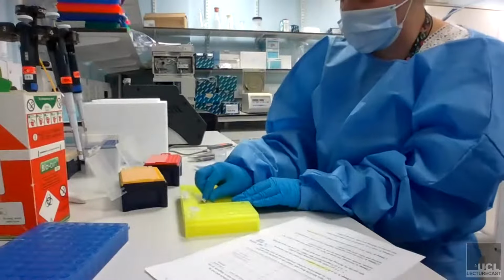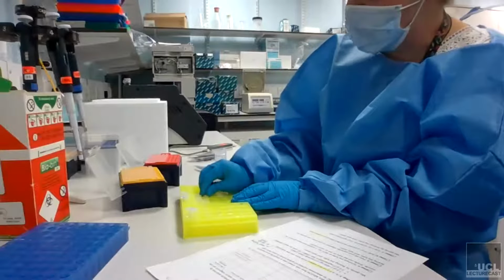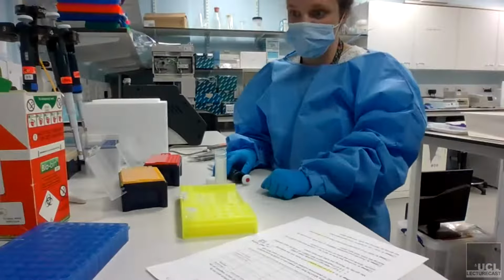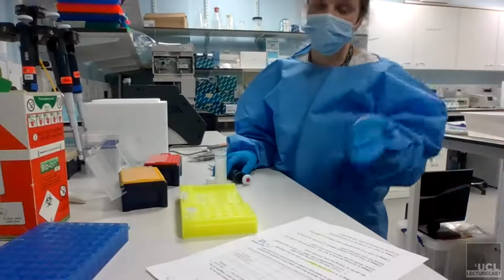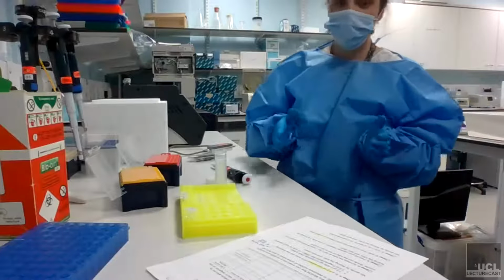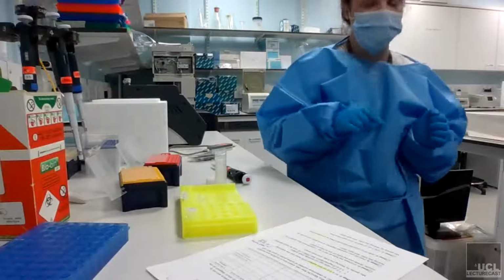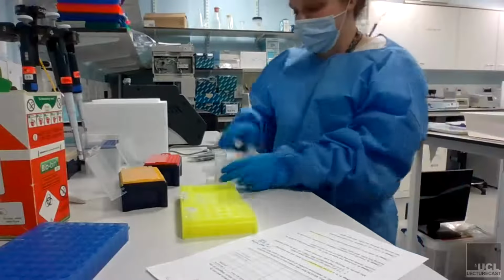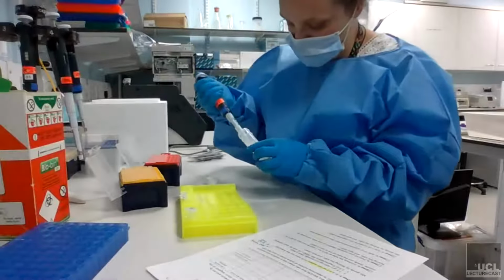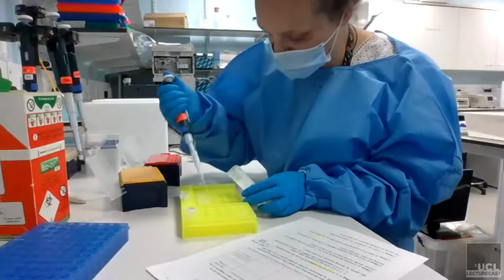So as I say, I'm going to pretend to sequence 5 different isolates. You can put different isolates together. So for instance, you can have E. coli and E. coli and Klebsiella and TB or whatever, because they will all be barcoded. So the computer will know which one is which, but you obviously have to barcode them before you put them together. And that's what this first step is going to be. So I'm just adding my water to my samples.